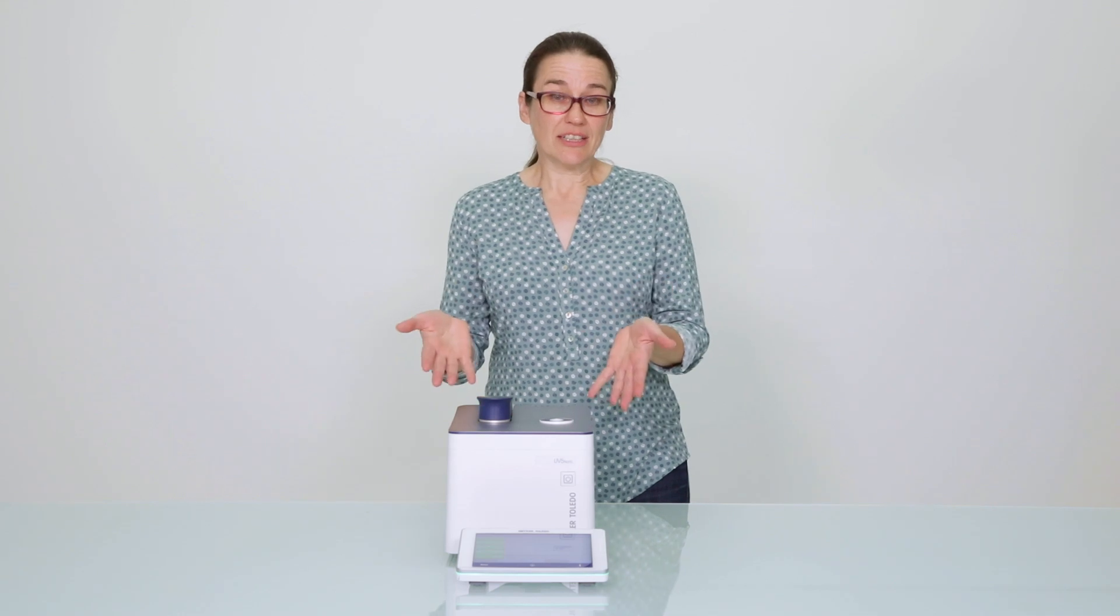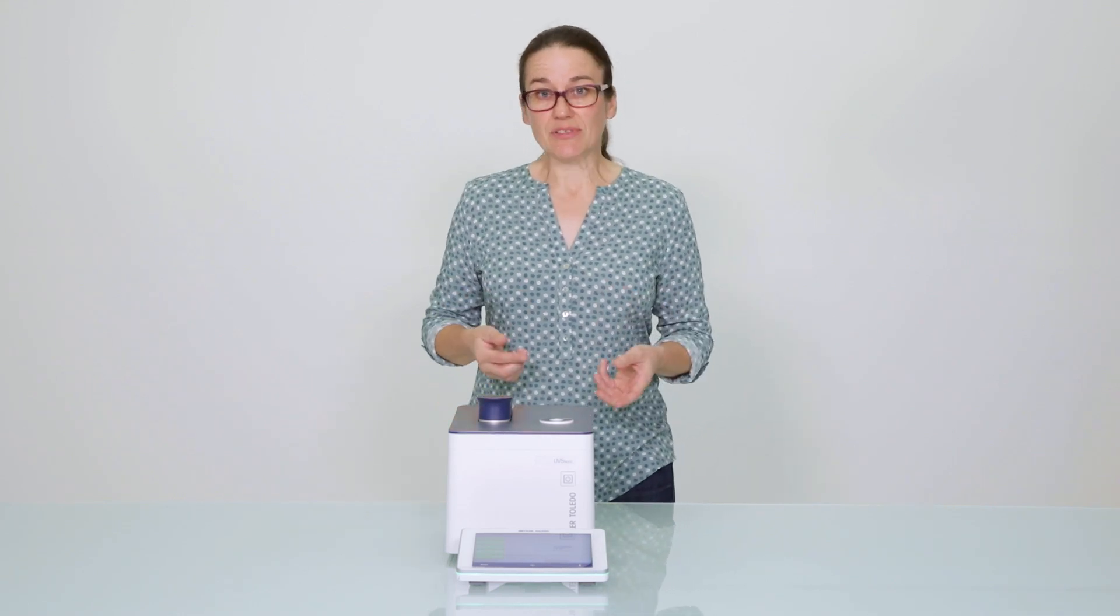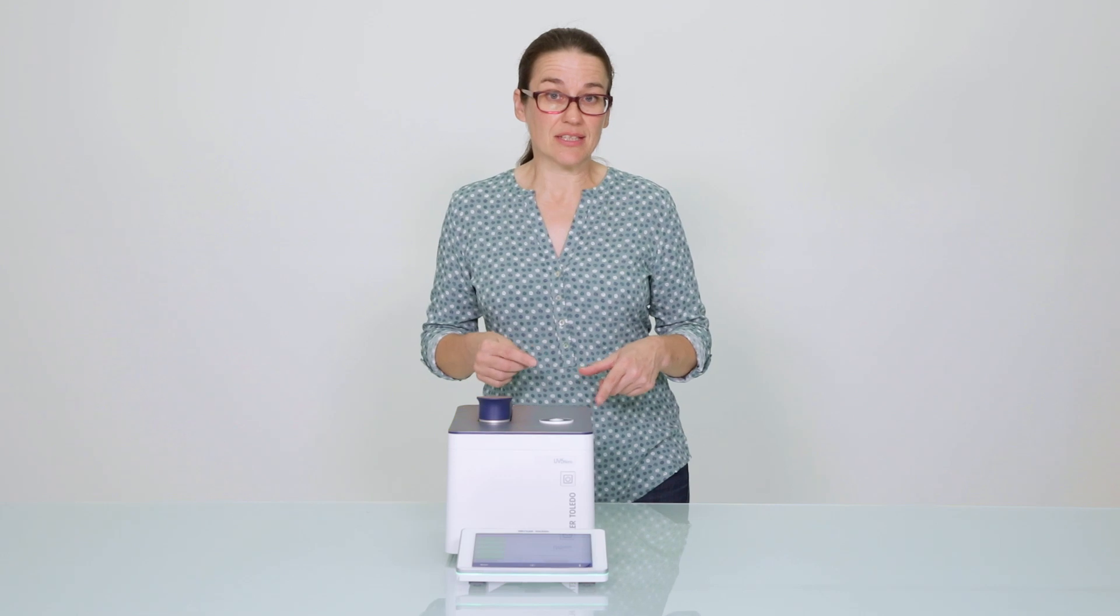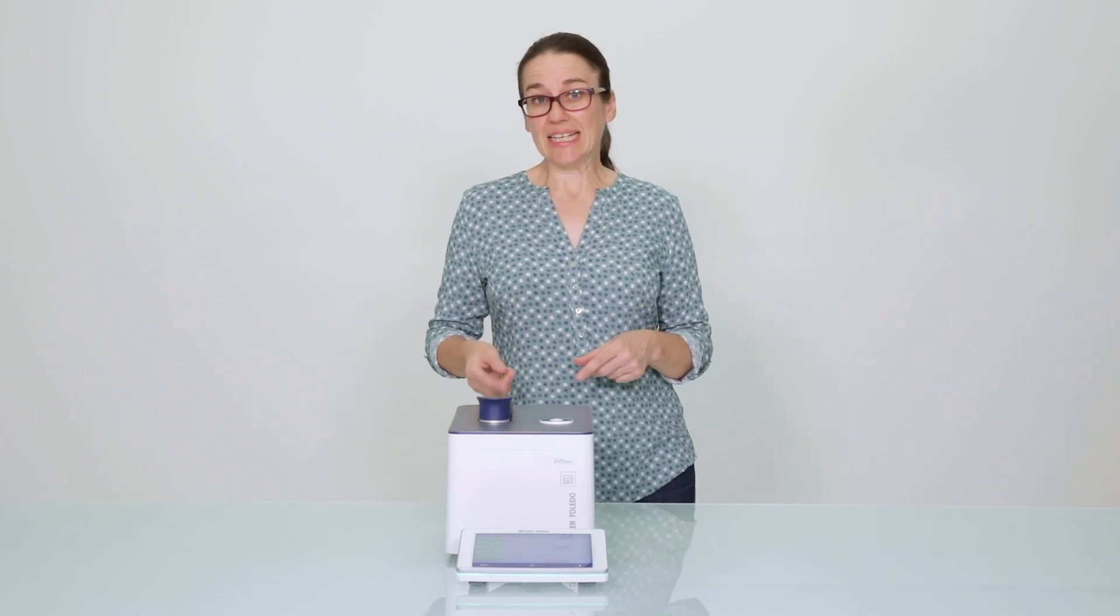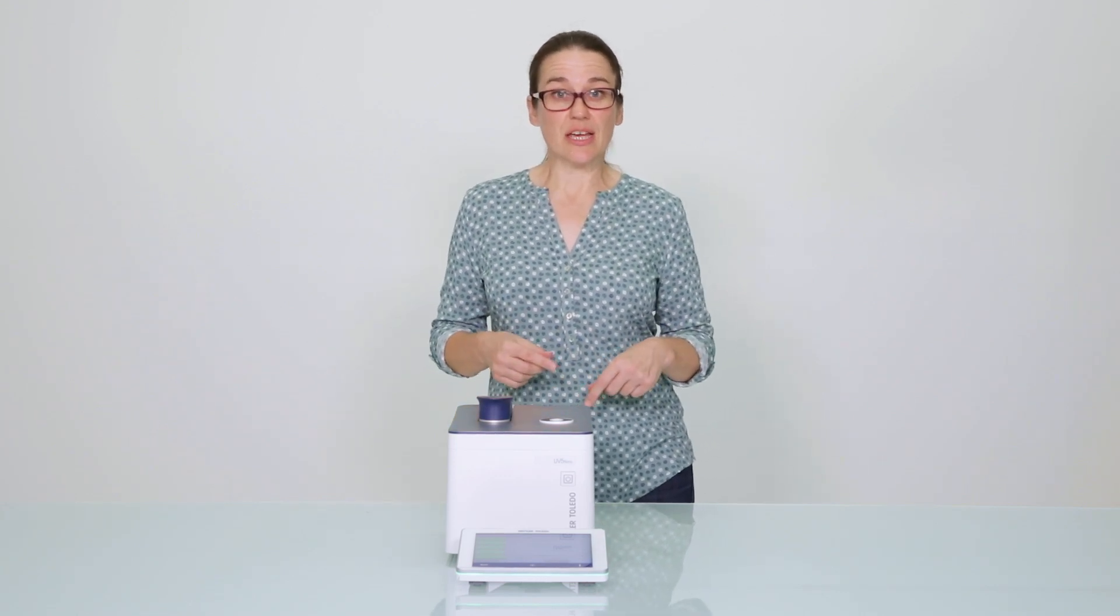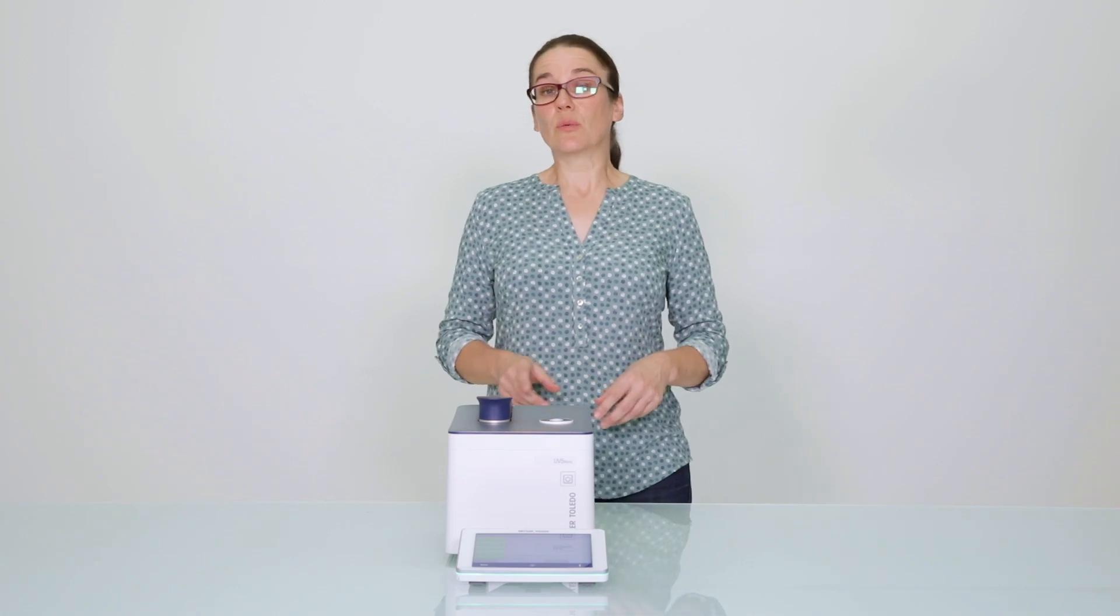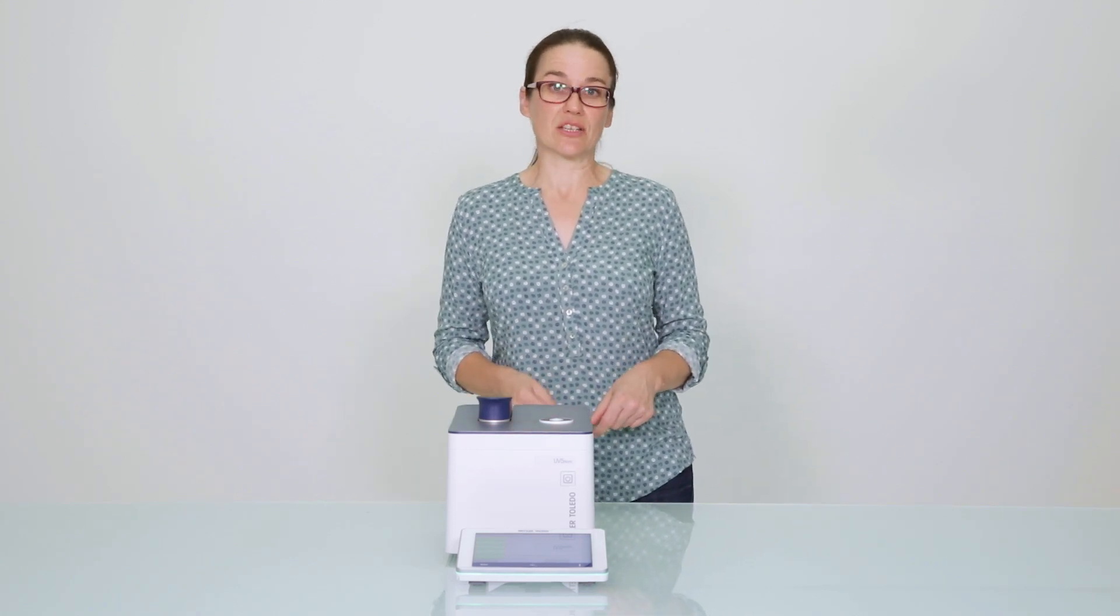The UV5 nano contains an extensive library of predefined life science methods, including DNA and protein concentration determination, and also a well-known bio application called OD600.